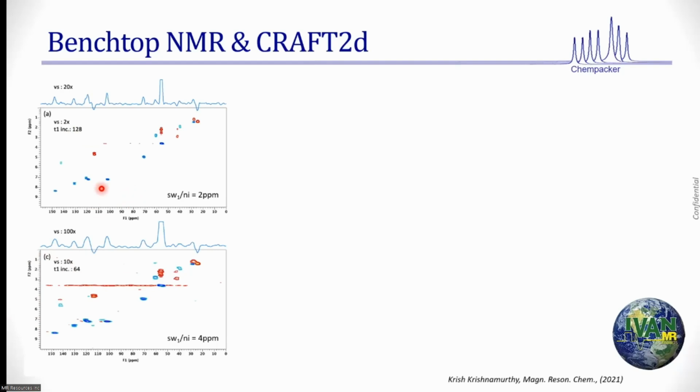Should I do 512? Do I have enough resolution? And so on, so on, so forth. Do I have a narrow peak? And so on, so forth.